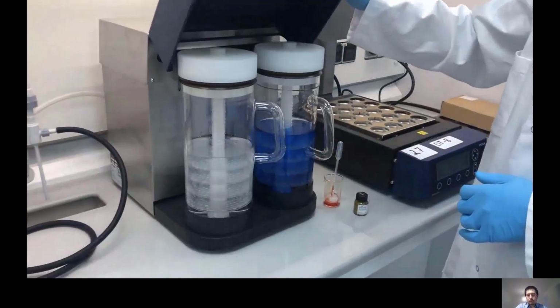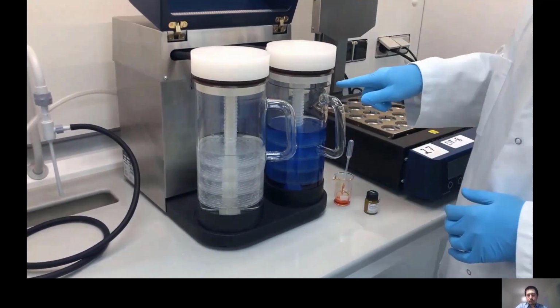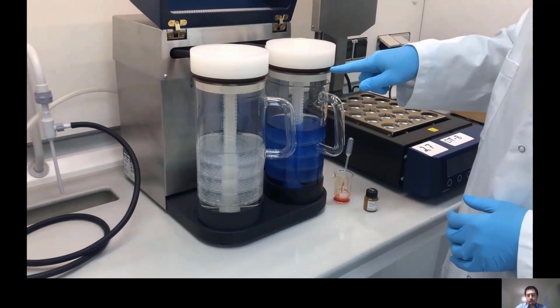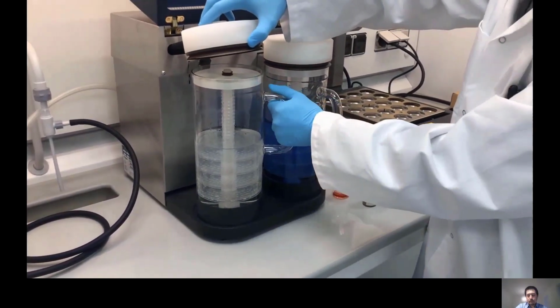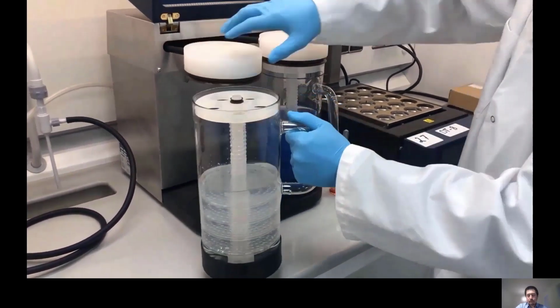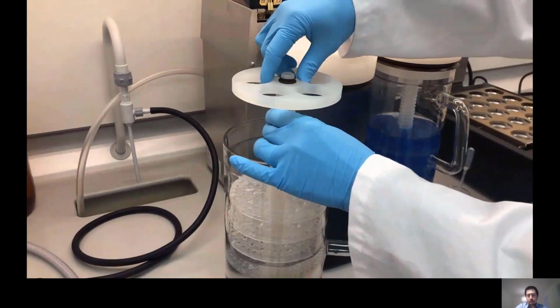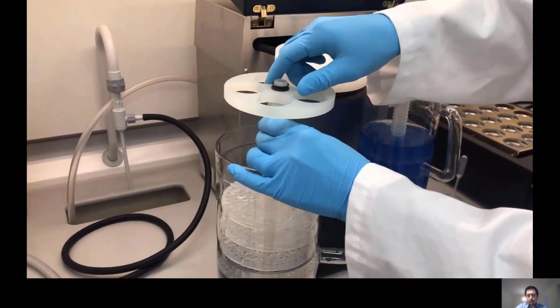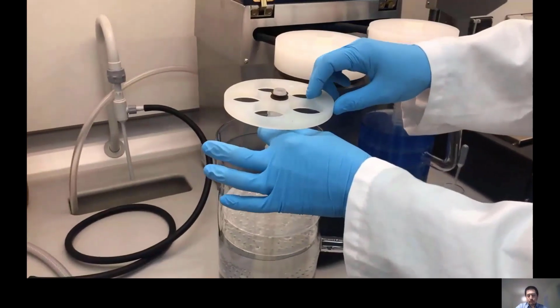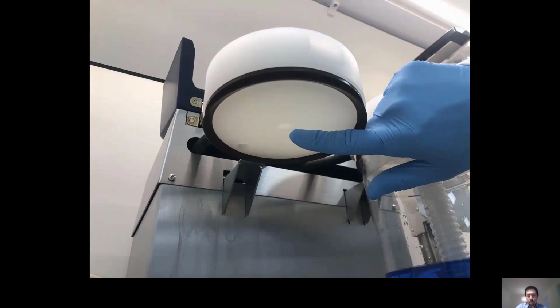For ensuring the correct vacuum for the scrubber unit, you can actually adjust the two discs that are within these two flasks. You can take it out here and lift it up, and then you can turn this up or down, and it will then be at the correct position to have a good vacuum when you put it in again.